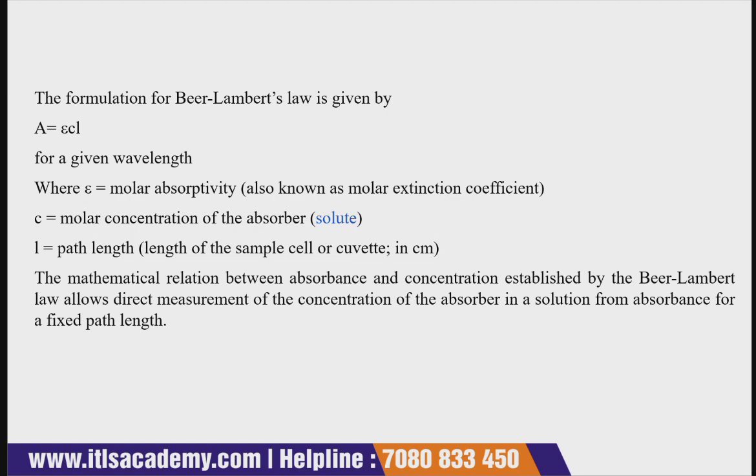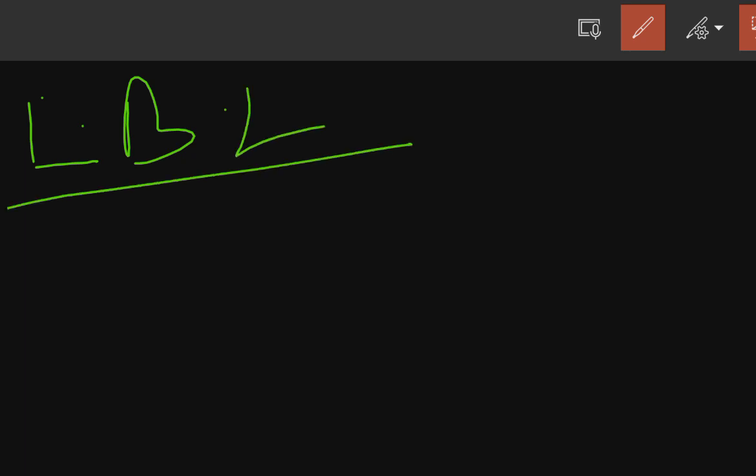So that we have already discussed. Again, I am just writing the whole Beer-Lambert law. Sorry, it's the Lambert-Beer law. I will write it as LBL because of the less space.